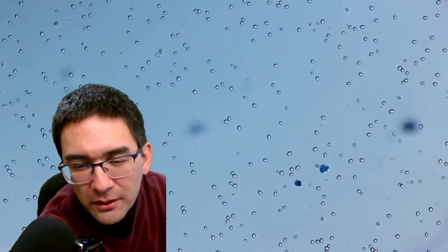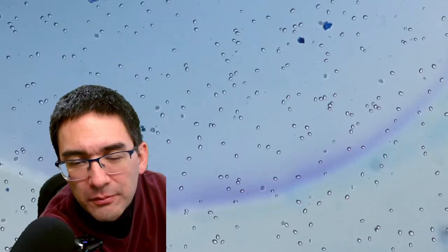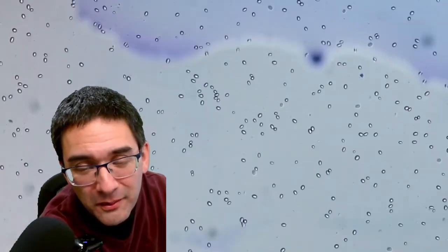And this is something that can be, you know, for example, these debris, I think there's some cell parts. They stain, but not the spores. This is nothing unusual because maybe the stain simply does not react with the spores. Or maybe the spores have a very impenetrable capsule or something around them that makes it not react so much.